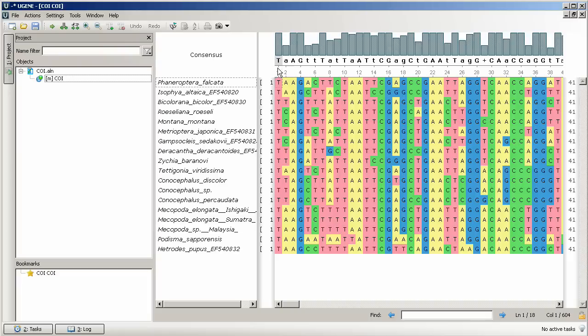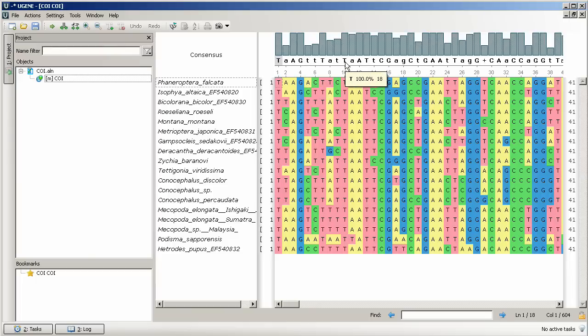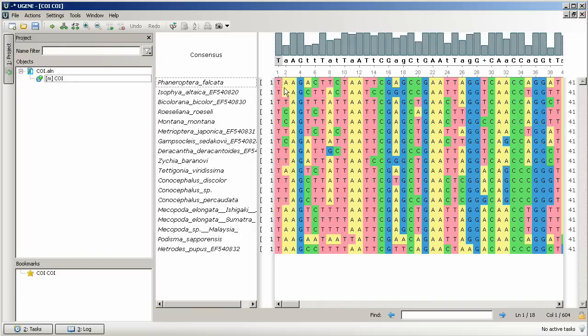Pointing mouse cursor anywhere at the nucleotide column, we can see the full nucleotide distribution for this position. The part of the view placed below contains the sequence names, per sequence offsets, and the sequences themselves.